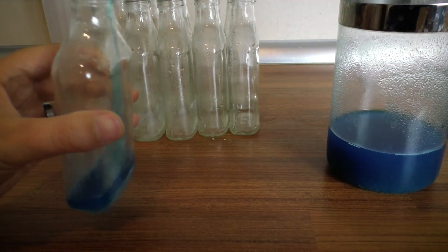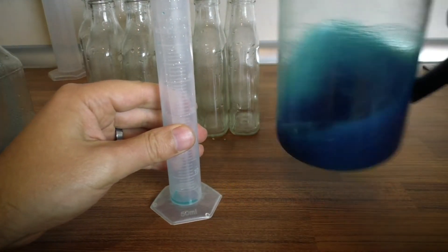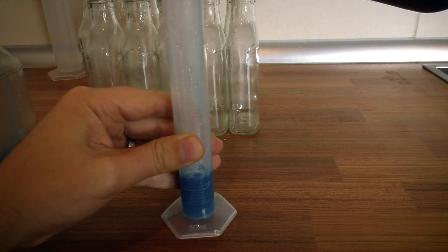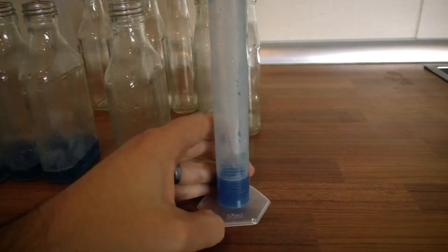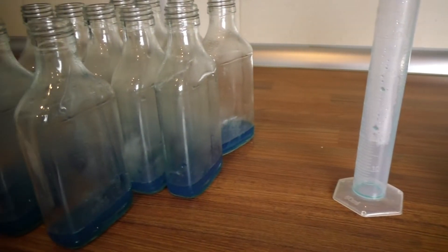Obviously it might be a different amount of liquid if you use a bigger bottle. I have seen videos of people using much bigger bottles like 500ml bottles. The main thing is that the bottles have to be able to stand up inside your pressure cooker — so that's a limiting factor.